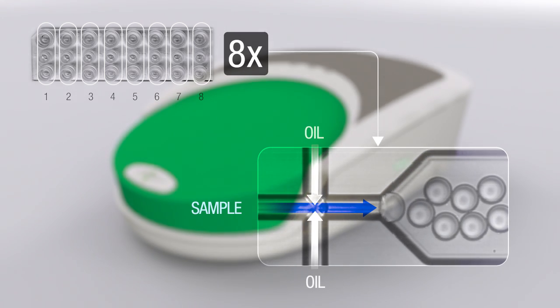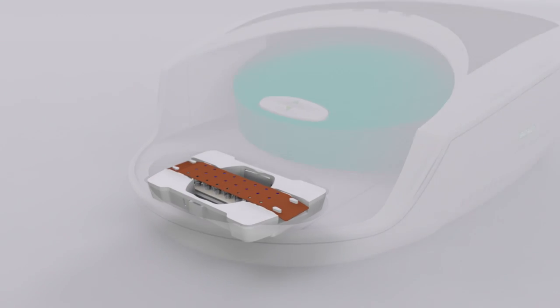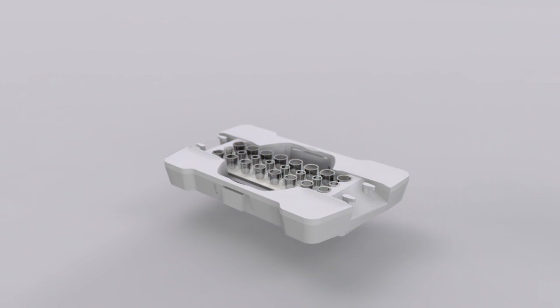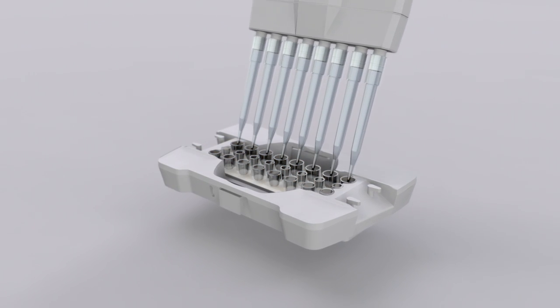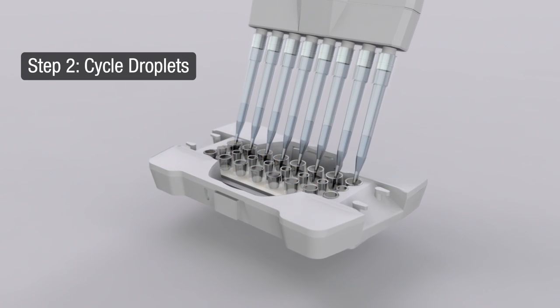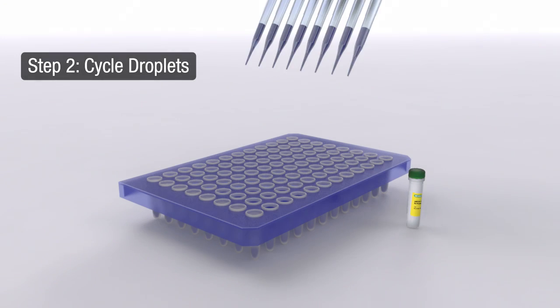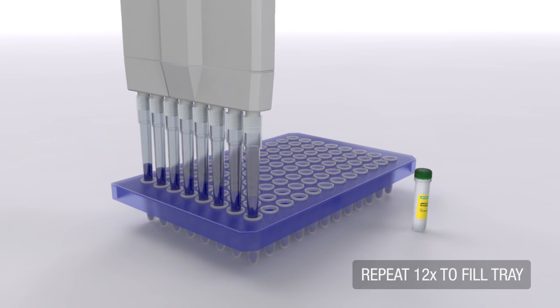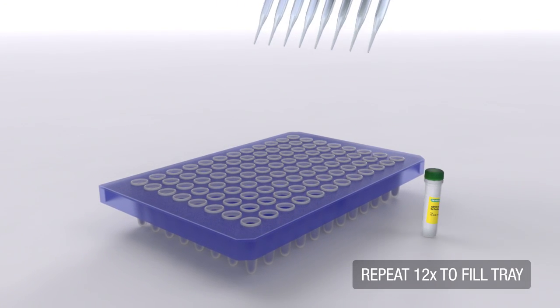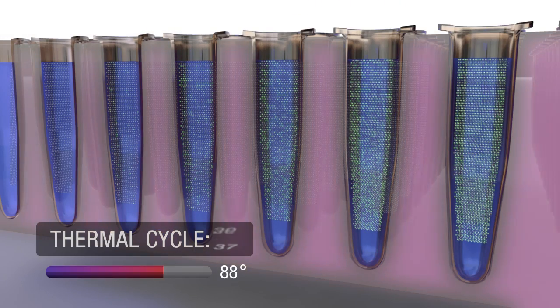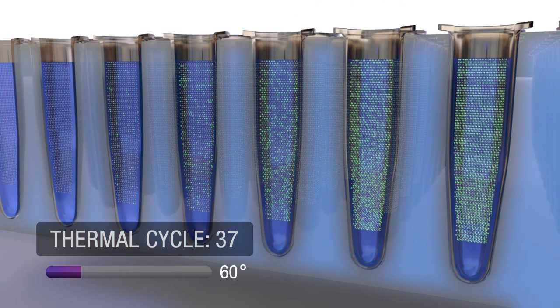Every droplet contains a nanoliter volume of the sample, including any target sequences that may be present. After the droplets are generated, the emulsified samples are transferred to a standard 96-well PCR plate using a standard 8-channel pipette. The plate is then loaded onto a thermal cycler where PCR is performed to amplify the target DNA to end point.